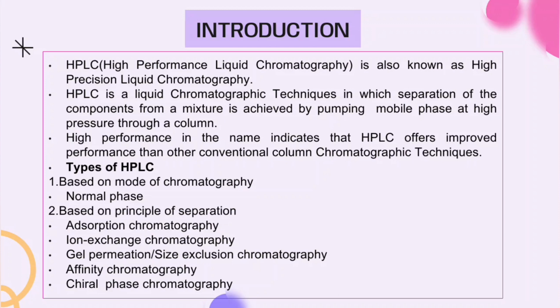High performance, as the name indicates, means that HPLC offers improved performance over other conventional column chromatographic techniques. This is because it utilizes a stationary phase which has very small particle size, so it provides a greater surface area.